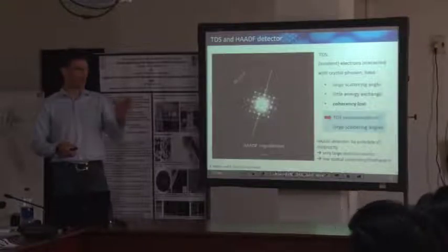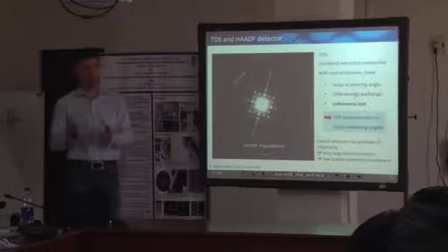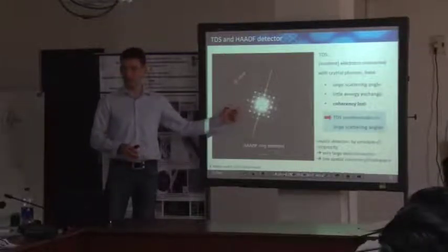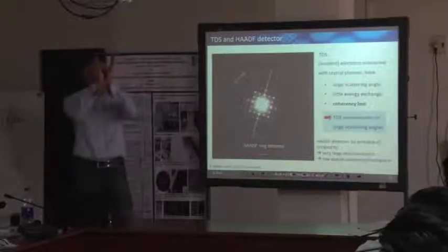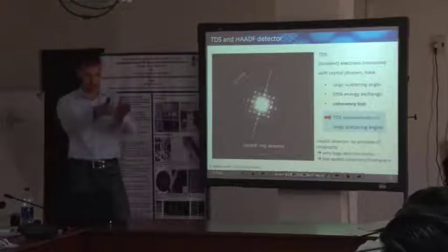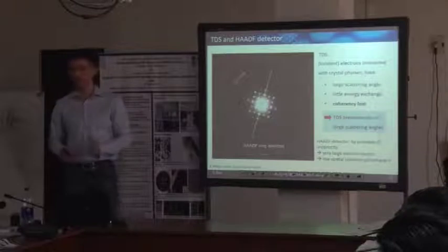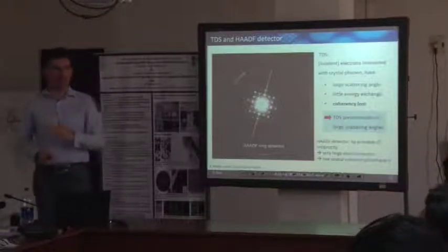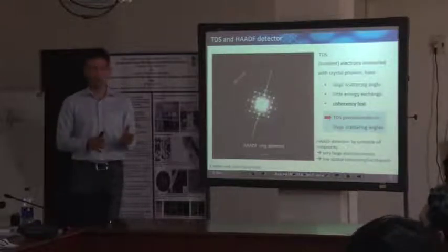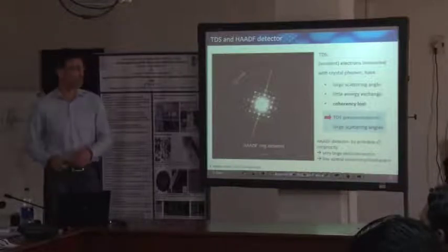And while you are able to record an HRTEM image even with a certain misalignment of a few degrees, let's say up to probably 2 or 3 degrees, you will end up with a crystal lattice fringe image. You will hardly achieve that with good contrast in STEM mode, because you can imagine that your electron probe has to propagate along this atomic column or your atomic planes, and you have to hit them almost perfectly. However, a misalignment of half a degree or so already leads to worse contrast, so to reduced intensity variations in your atomic resolution pattern.